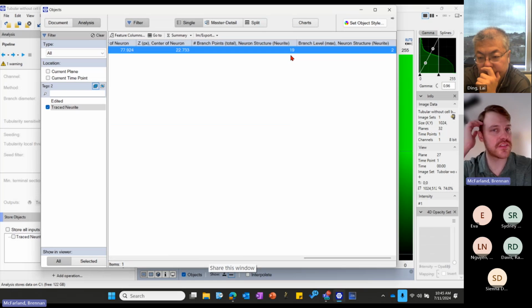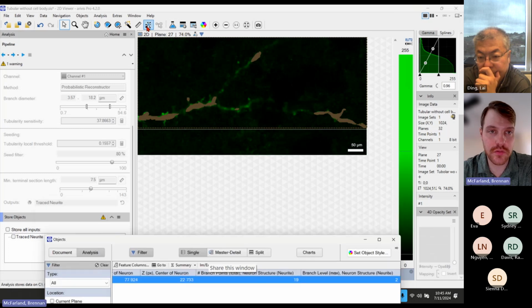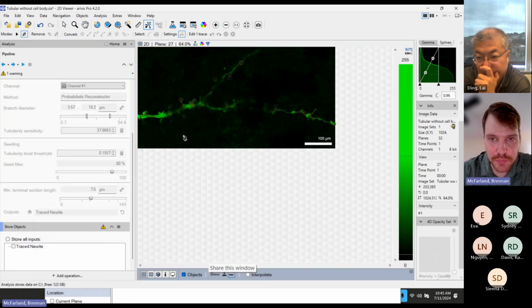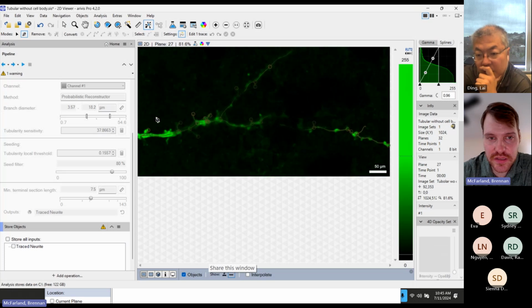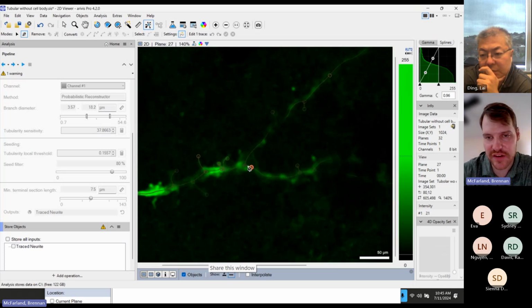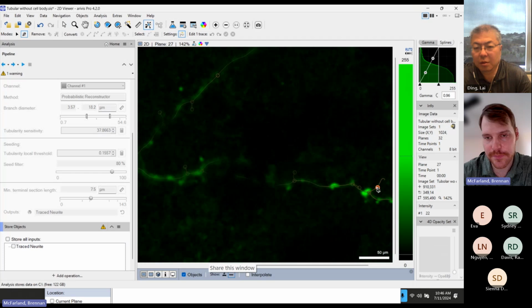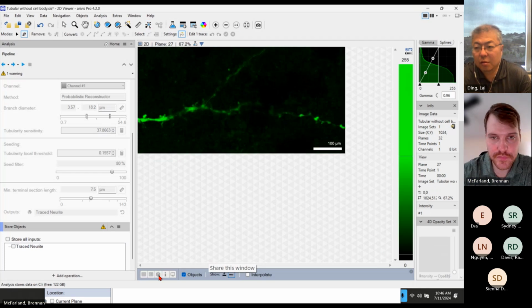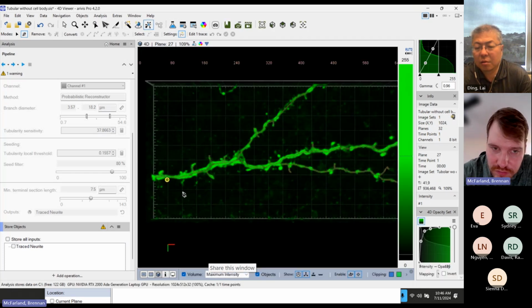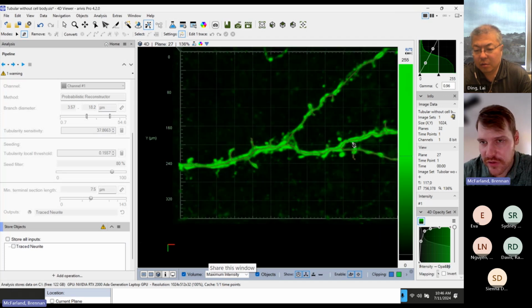The number of branch points. So go back to here. These branch points would be regions of larger deviations. My guess is that it would count this as a branch point, this larger one as a branch point, etc. This one over here, a larger one. Go 3D and look at it too. Or it may just be all of these branch points right here because we have 19, right?